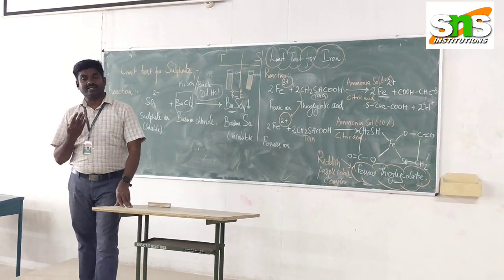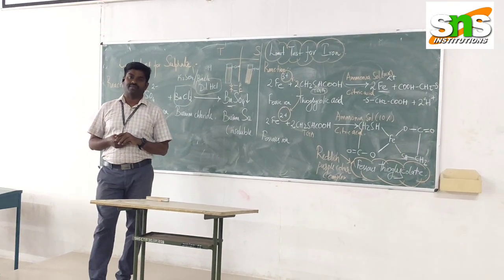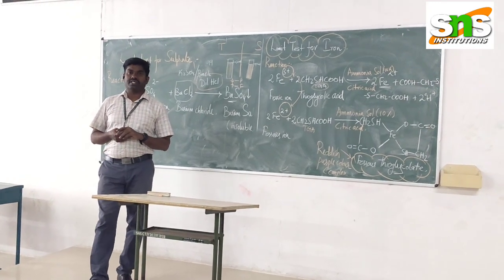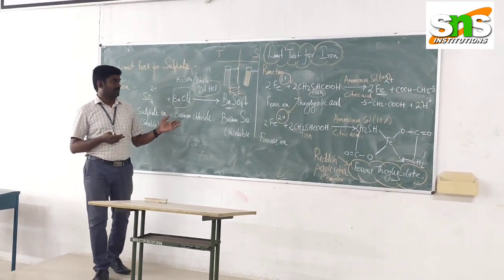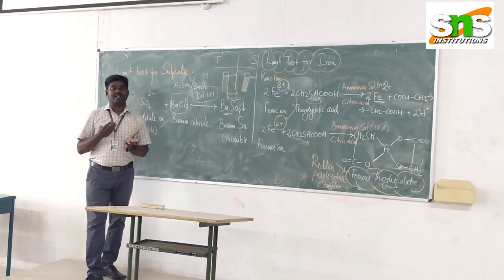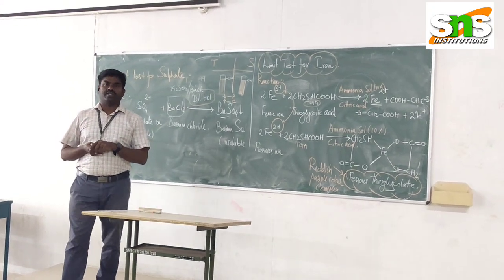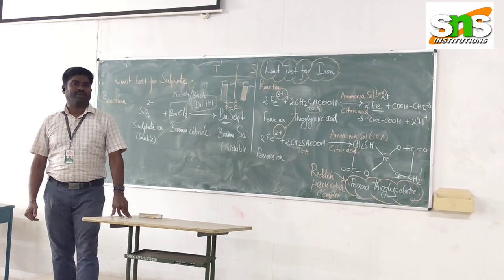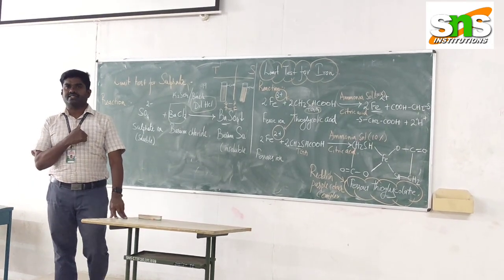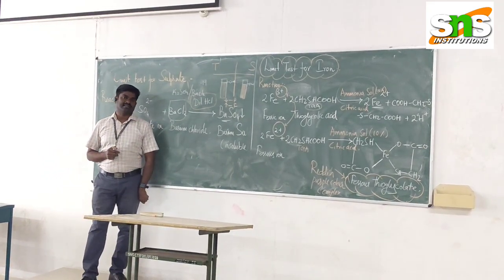That condition, we can consider the given sample as another option. It is a semi-quantitative analysis type.